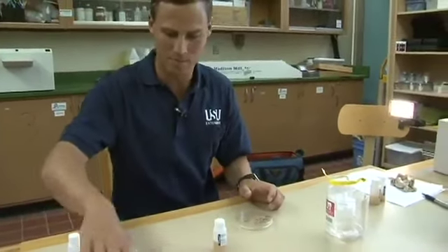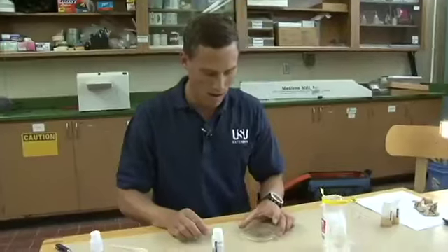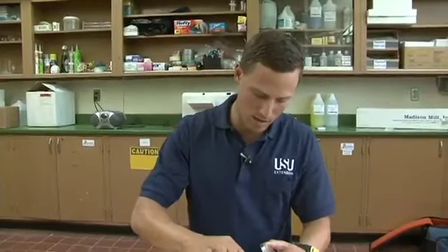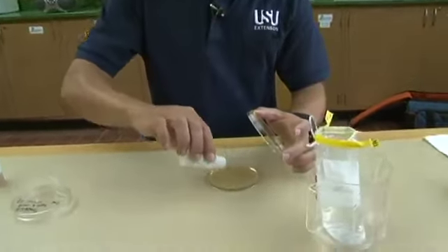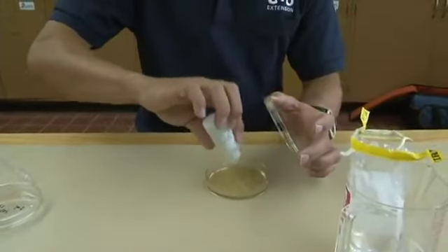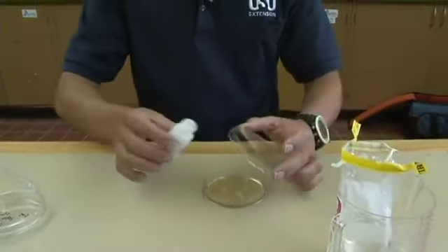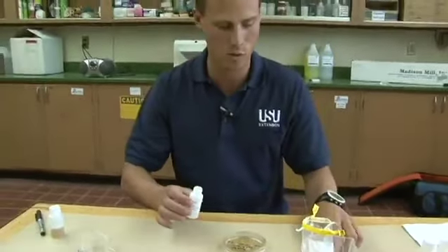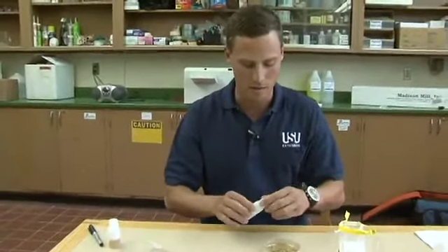So now that I have this ready — taking the E. coli Easy Gel Medium, gently swirled it — I will open it up, open my petri dish, and pour it out, evenly moving it around all across to make sure I get everything in there. Once again we want to keep these things sterile, so I'm just opening it and closing it. And that's all I'm going to do for the sample gel.